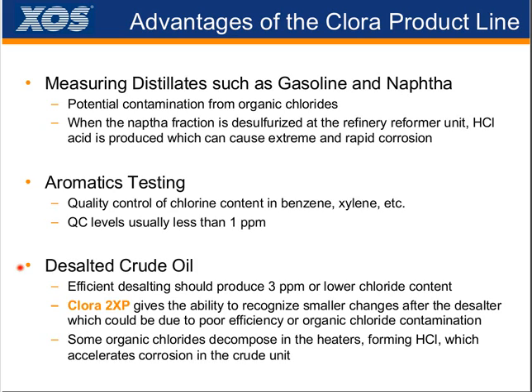And then finally, with desalted crude oil, like we talked about at the beginning of the presentation, at and around the desalter, you want to know what your chloride levels are. You want to know coming into it what your expectations are. How much salt are you removing, and then once it gets through the desalter, you want to be able to understand what's left over. And out of what's left over, is it organic? Is it inorganic? You may not know right away, but you'll know immediately, if you have a core instrument that you can get a 5-minute measurement and get that number.